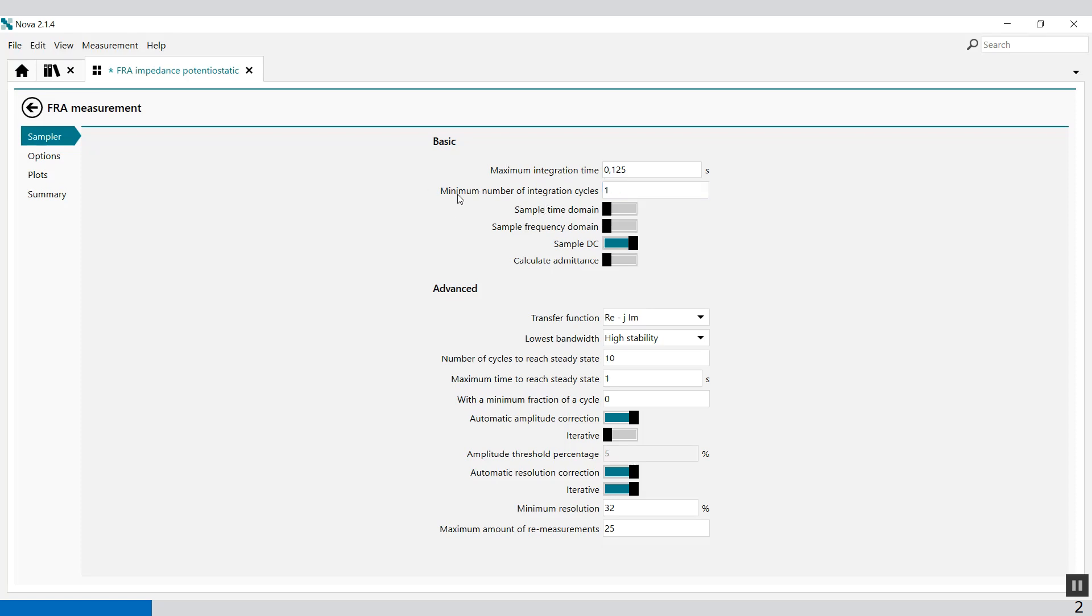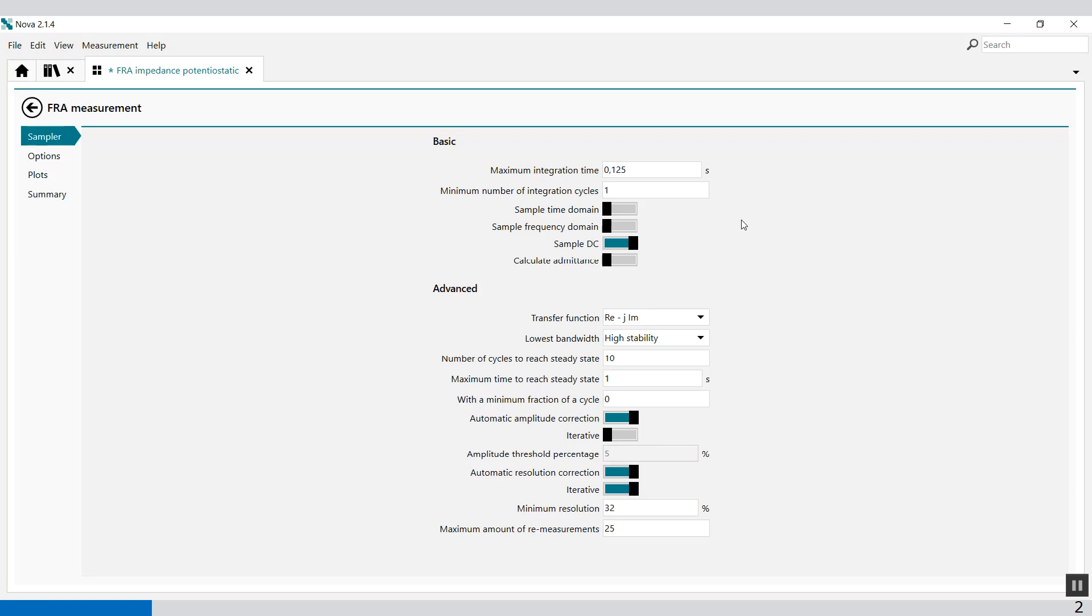Then you have the minimum number of integration cycles. This defines the minimum cycles of the AC response to record for data analysis. The minimum value is one cycle and the maximum number is 16. Integrating over a large number of cycles increases the duration of the measurement but improves the signal-to-noise ratio. This value must be an integer, which means 1, 2, 3, etc. The default value is 1.